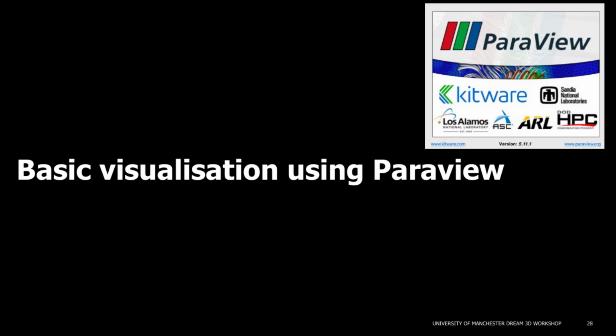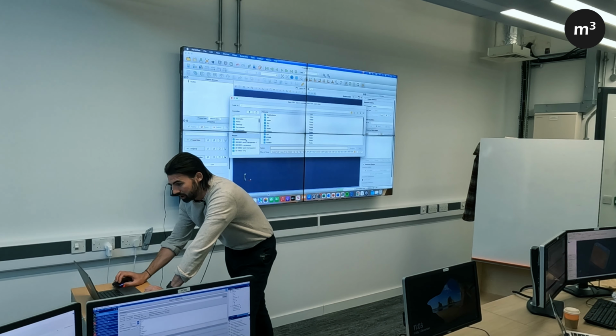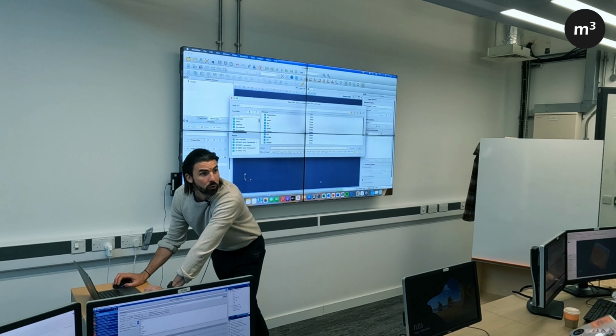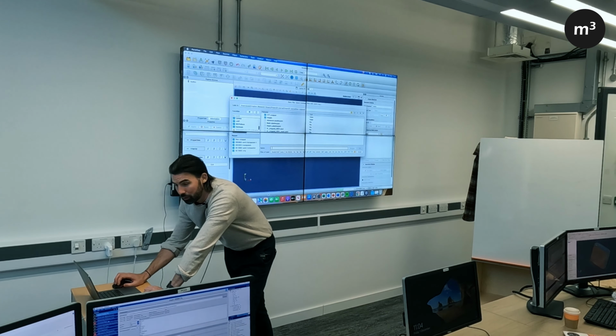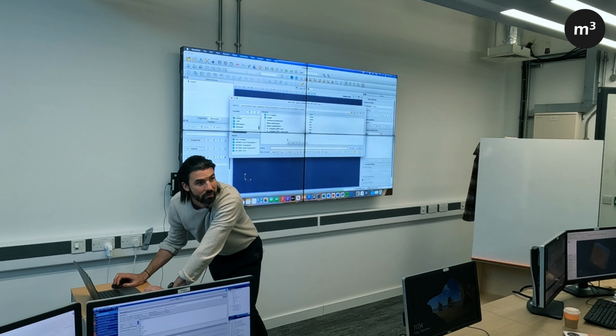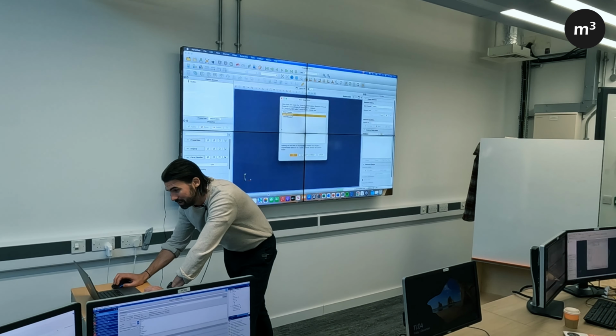Right, so if we load up Paraview, here's one I made earlier. Once you run the basic pipeline, you will end up writing the .dream3D file. So if we find our way to that, you will see Paraview can only see your .xdmf, that's your header file, so it can't see the Dream3D file. You'll point it to the .xdmf, which you create.